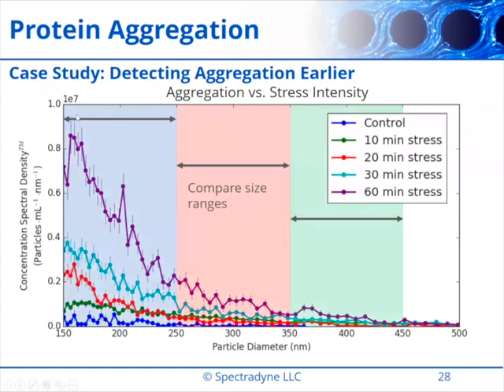So in blue, from 150 to 250 nanometers, we're going to call out the concentrations in these bands. And the point of doing this is to try to drive home that there's 2 benefits from being able to measure smaller particles. When you measure smaller particles, you effectively are measuring potential problems or stability earlier in the process, so you don't have to wait as long, right? Because the particles haven't needed to form as large an aggregate, okay?